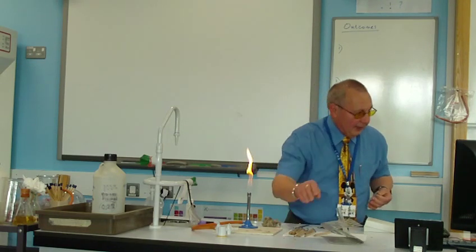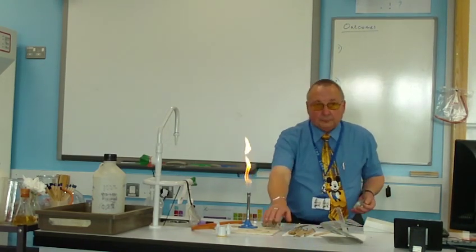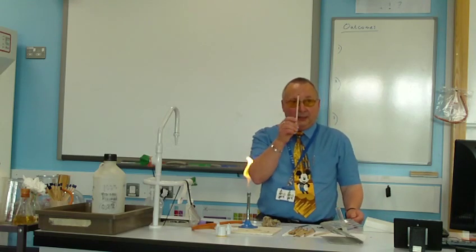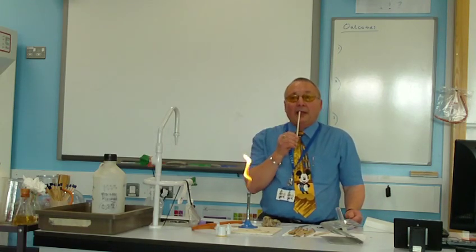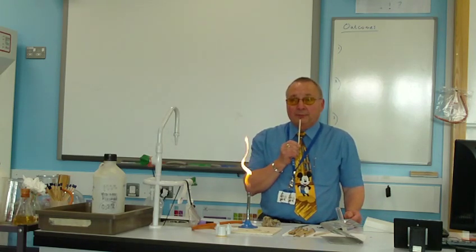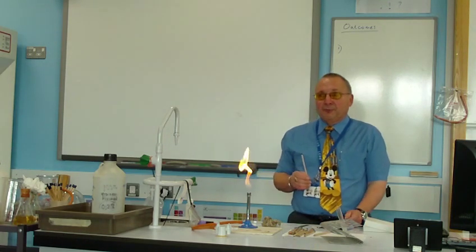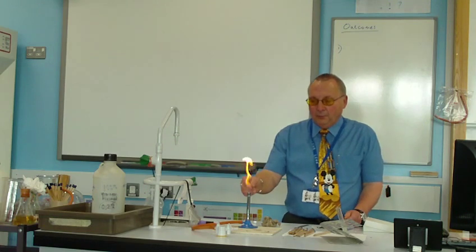Now, I shall have the Bunsen, again, and one of these mats. Because with the splint, if you blow it, what can happen? You can blow the flame onto somebody's clothes or hair.